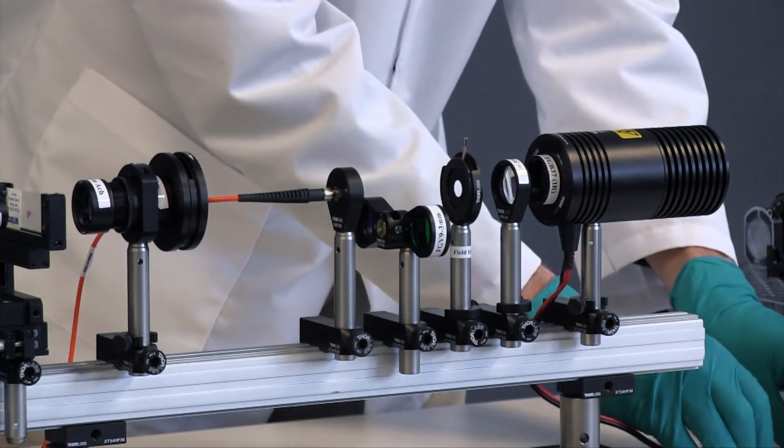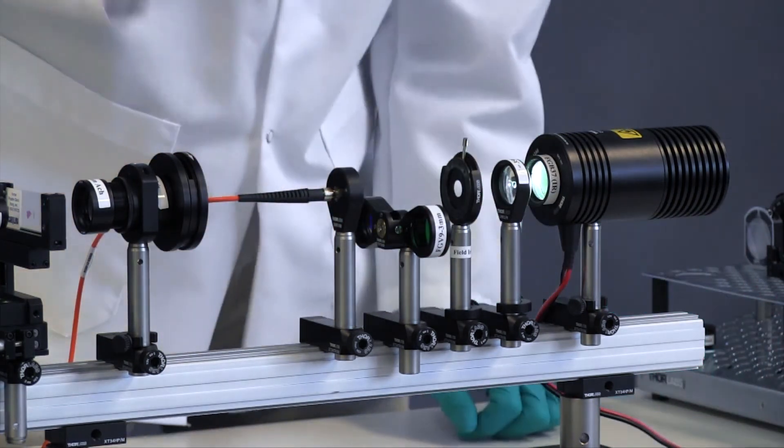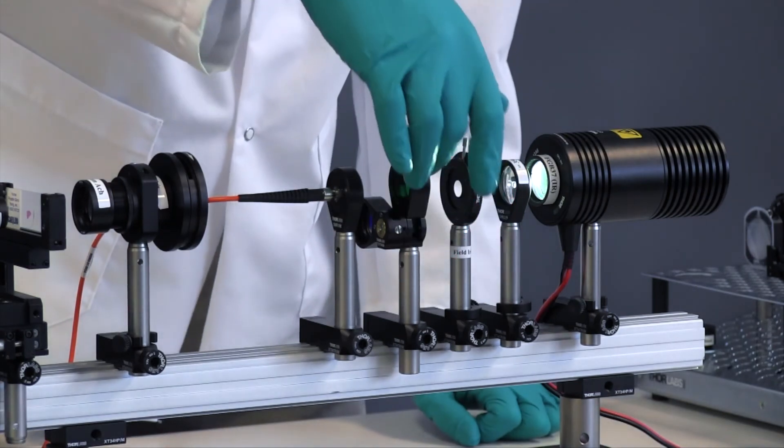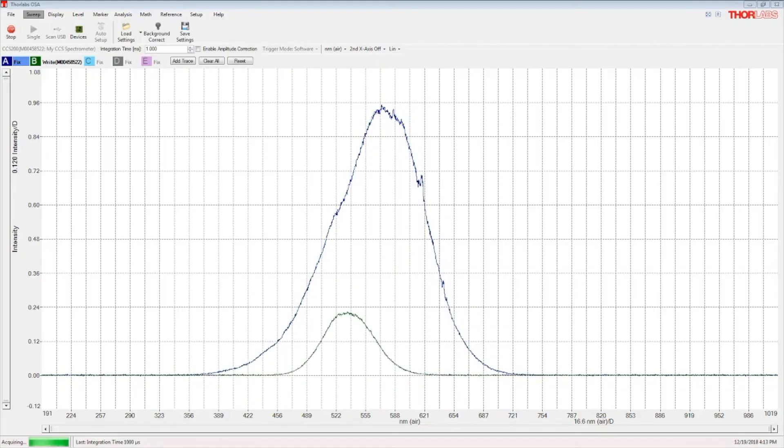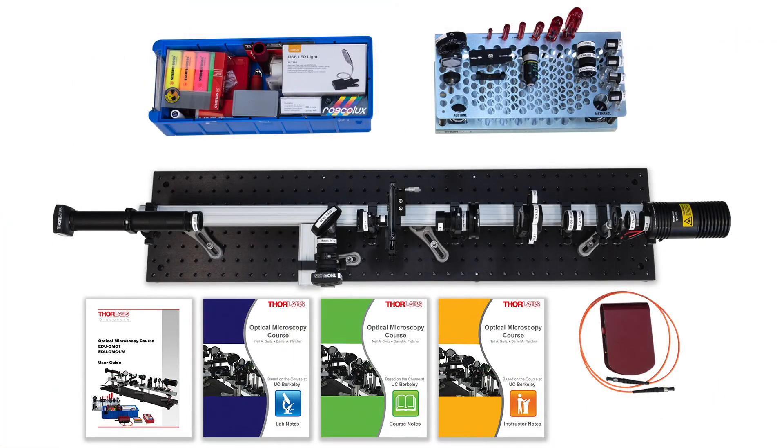These 10 labs give students hands-on experience with the basics of optical imaging, resolution, and contrast. To support both students and instructors, the kit is accompanied by substantial step-by-step lab procedures, theory notes for students, and instructor notes with lab teaching tips.